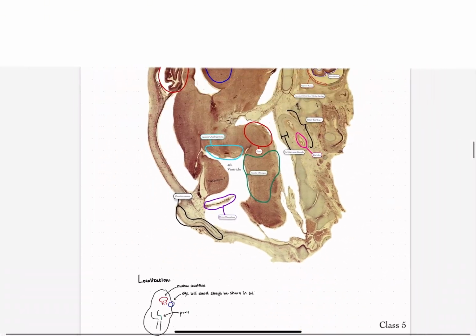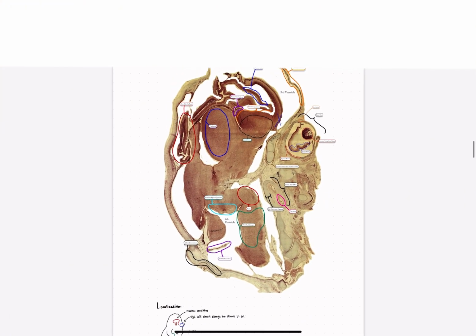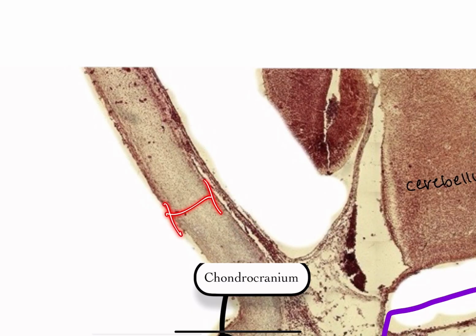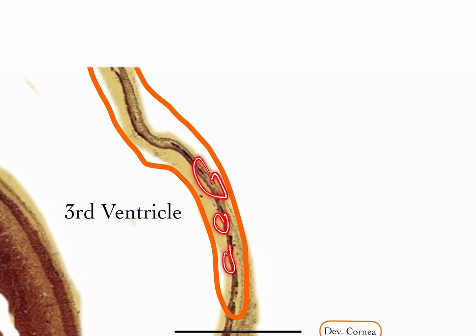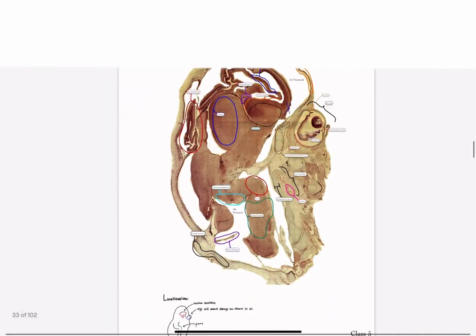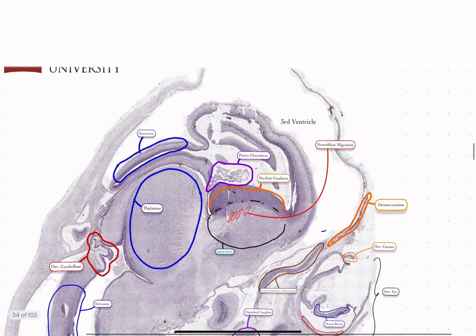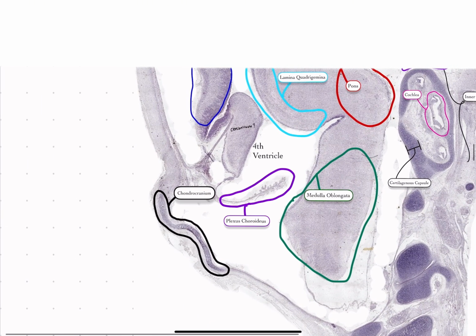While the chondrocranium, we can pretty much see almost at the bottom of the face towards the mouth area even, and it's a lot thicker. It appears very much like a hyaline cartilage, while this appears very darker and almost like it's about to shatter and fragment. Let's look at other parts. Here we have the desmocranium, like I said, very dark in appearance and looks like it's about to shatter. It's very, very thin. While here, the chondrocranium, we can see again, very hyaline cartilage-like in shape and appearance.